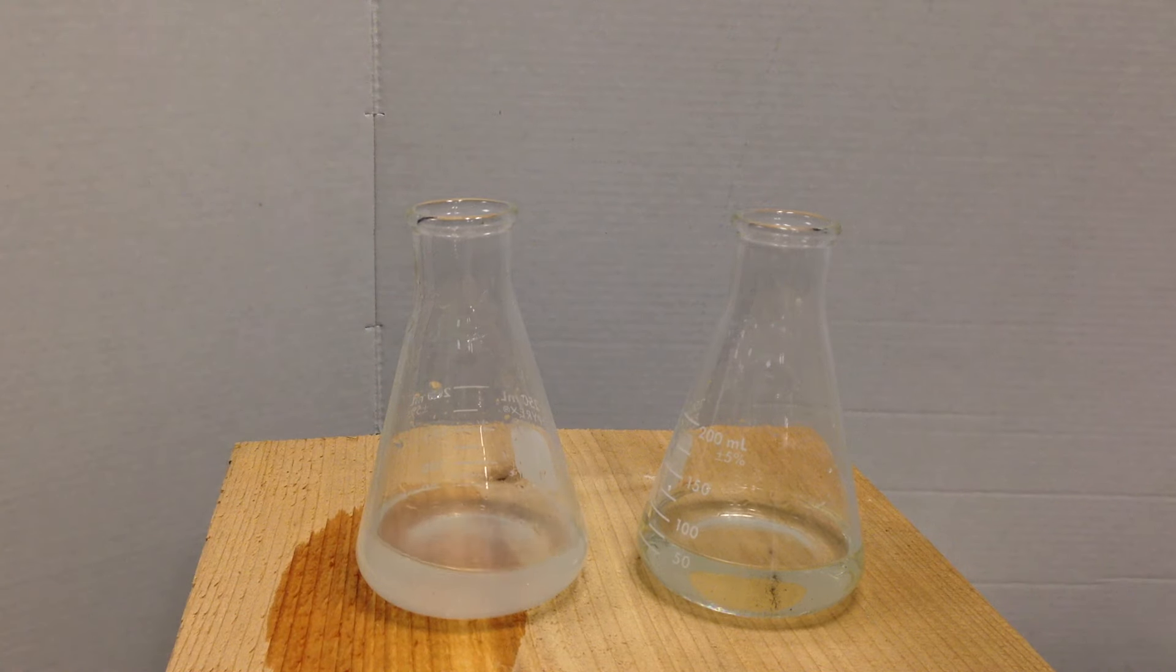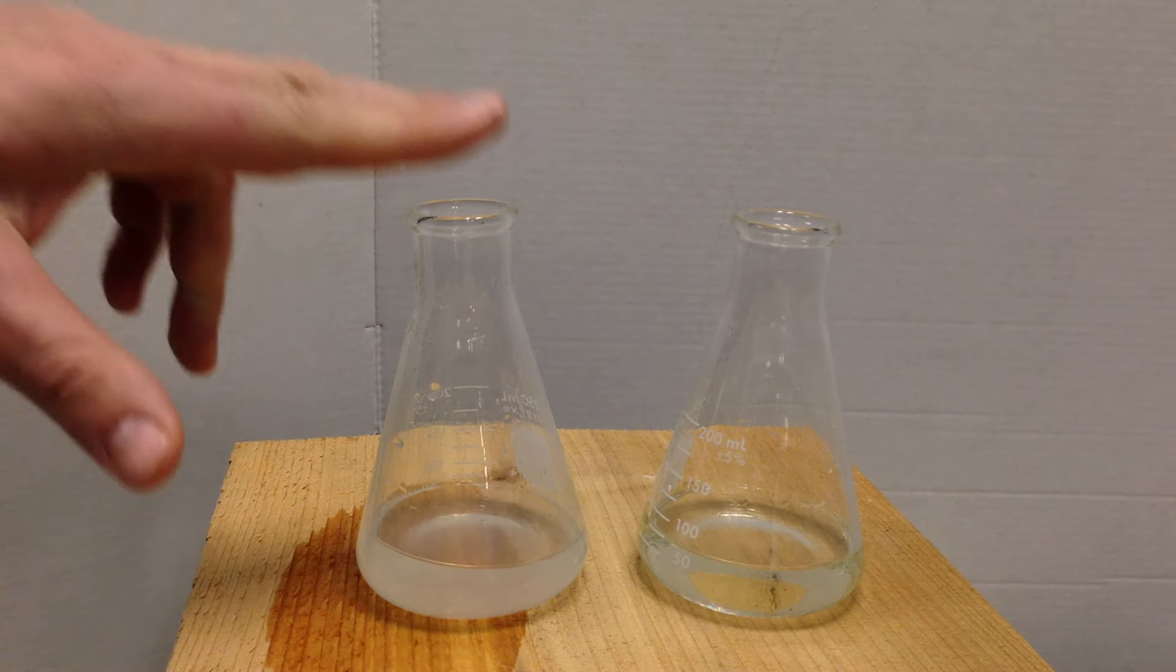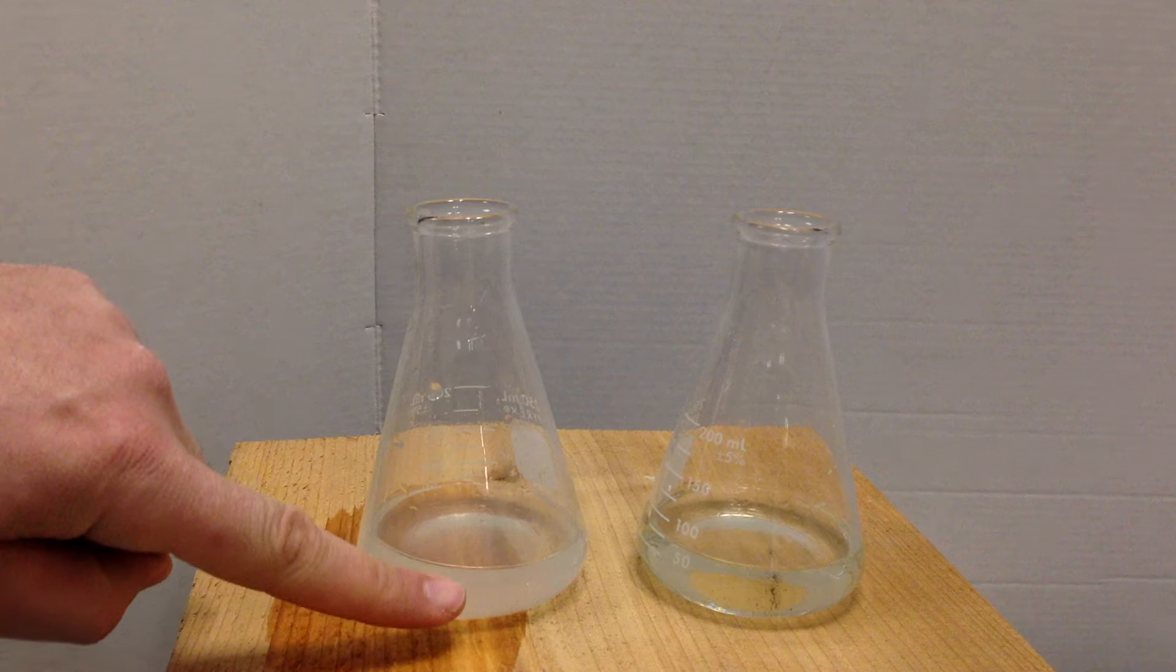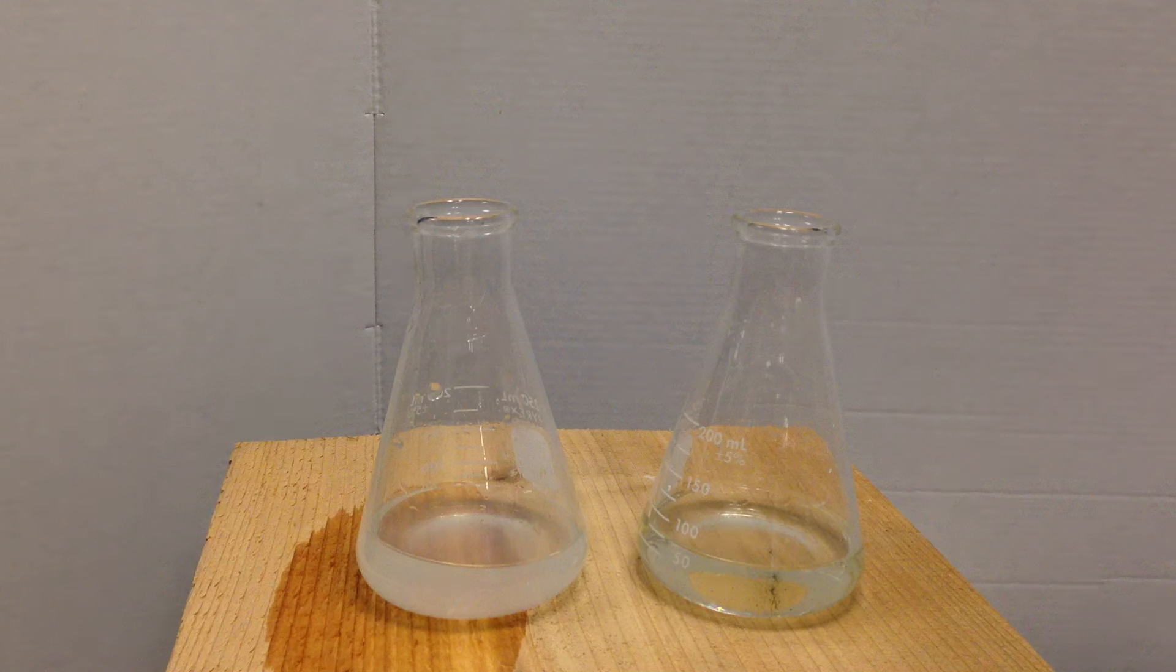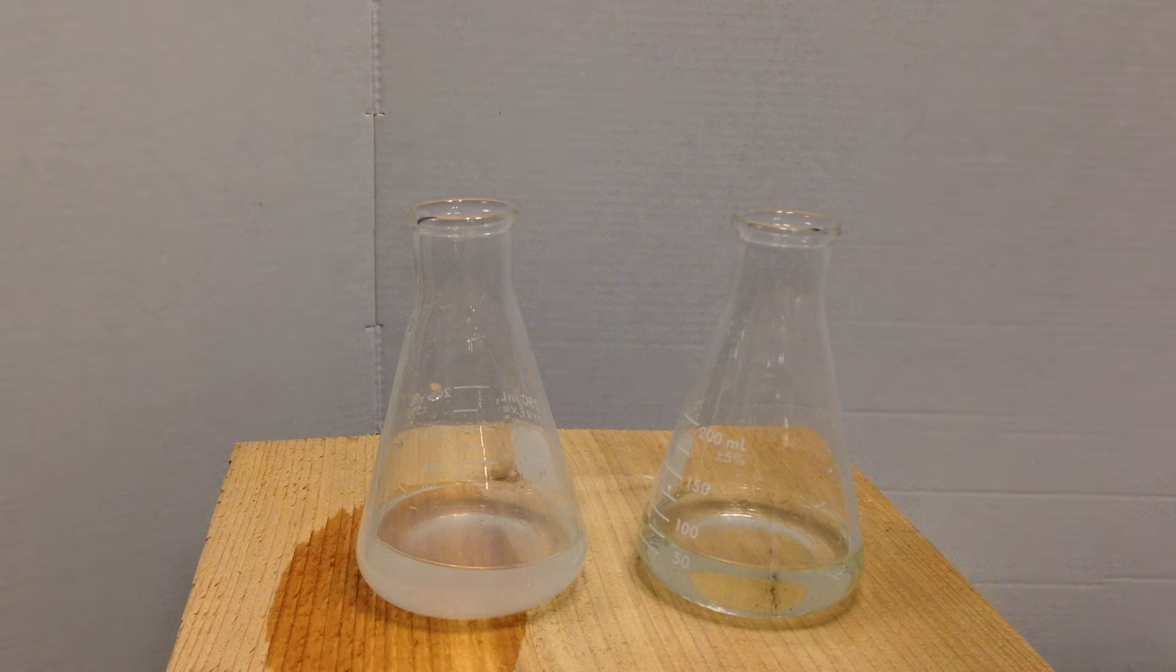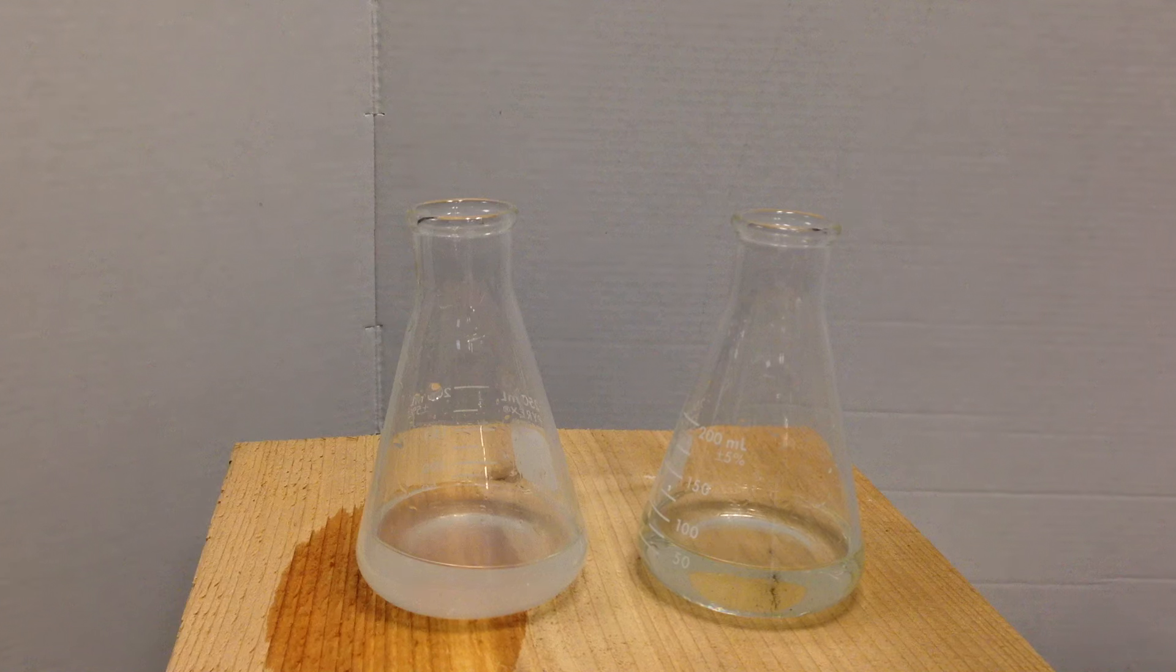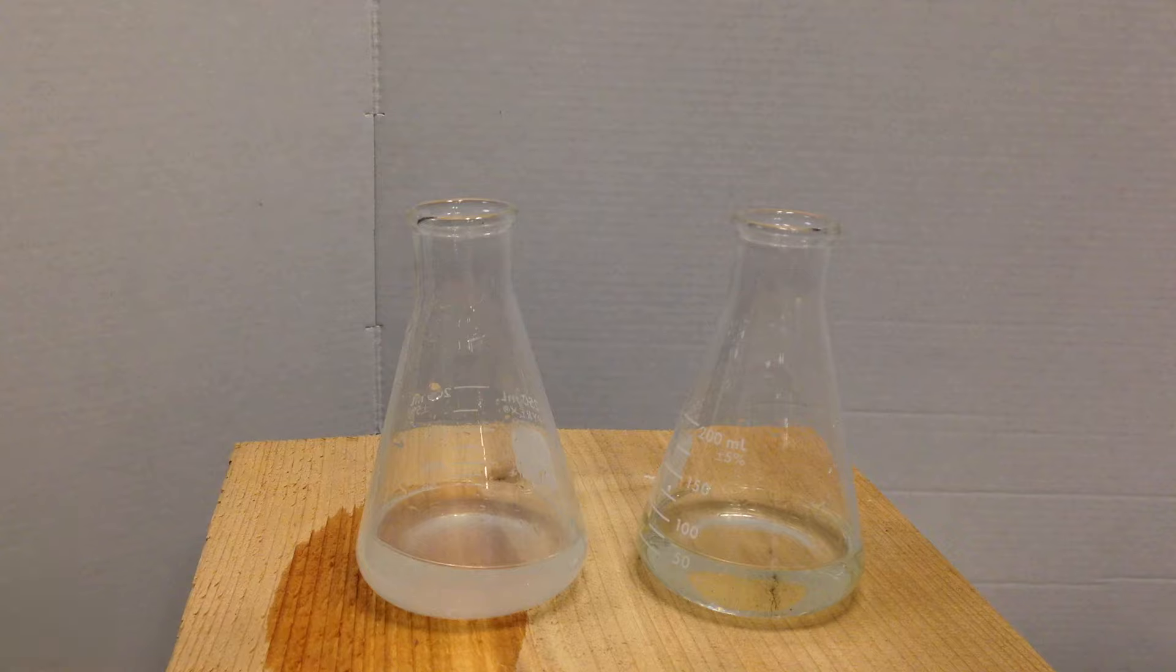So I'm going to pour these together and take two aqueous solutions and see if a precipitate results. Now precipitate is when a solid comes out of the solution because we're going to do a double replacement or something called a metathesis reaction. Lead plus two from this beaker is going to attract and hook up with the iodine ion to make PbI2 or lead iodide and that is going to create a precipitate because the lead iodide prefers itself more or attracts itself more than water. So let's do that.